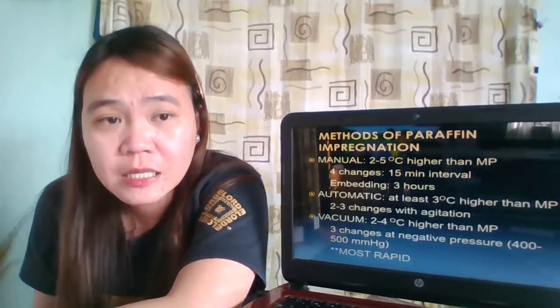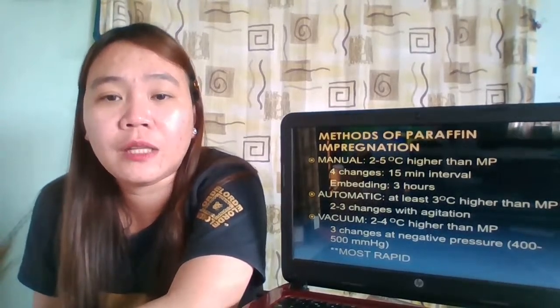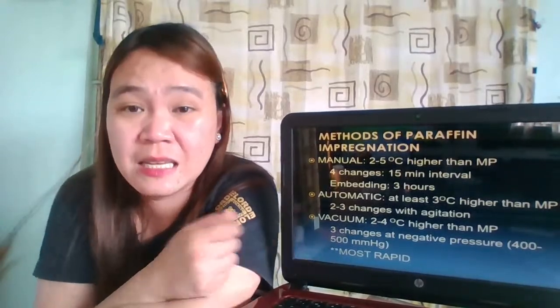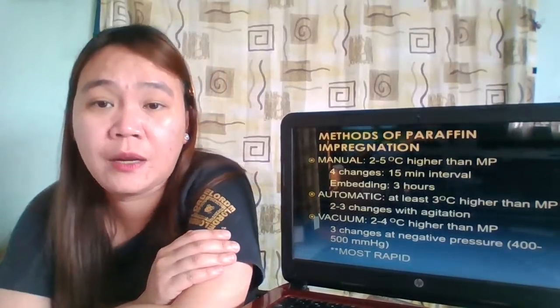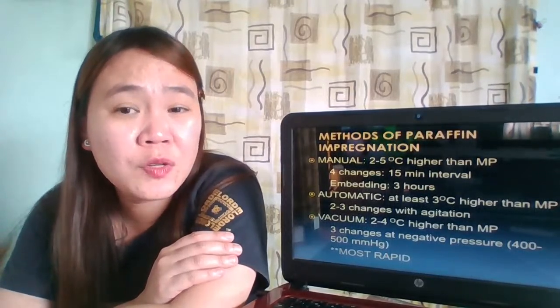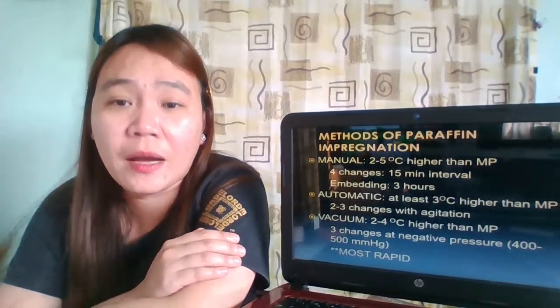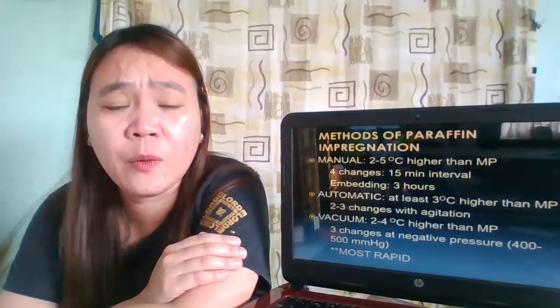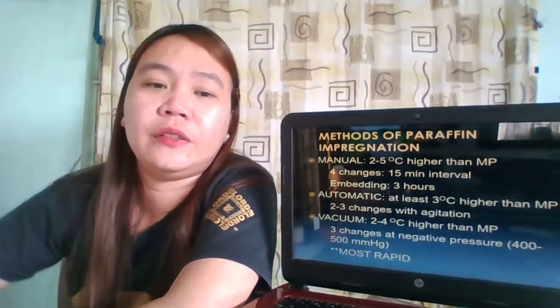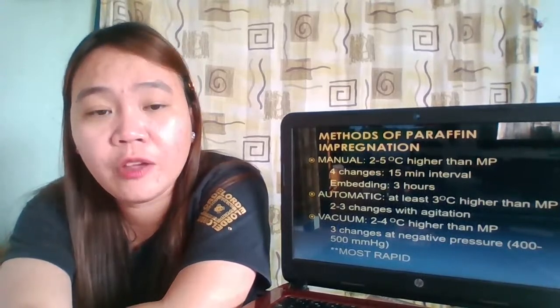Thus your vacuum method is considered to be the most rapid or the fastest paraffin wax impregnation or infiltration.